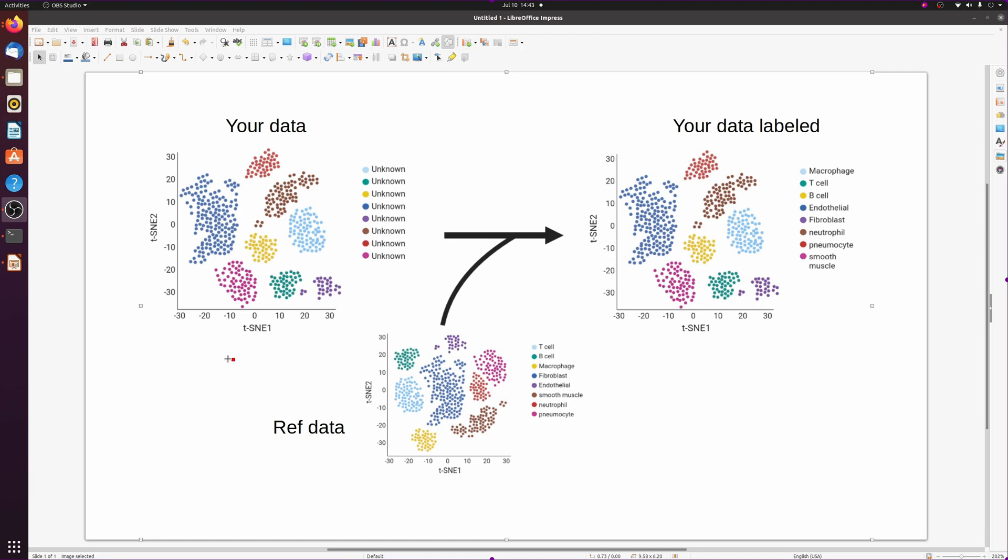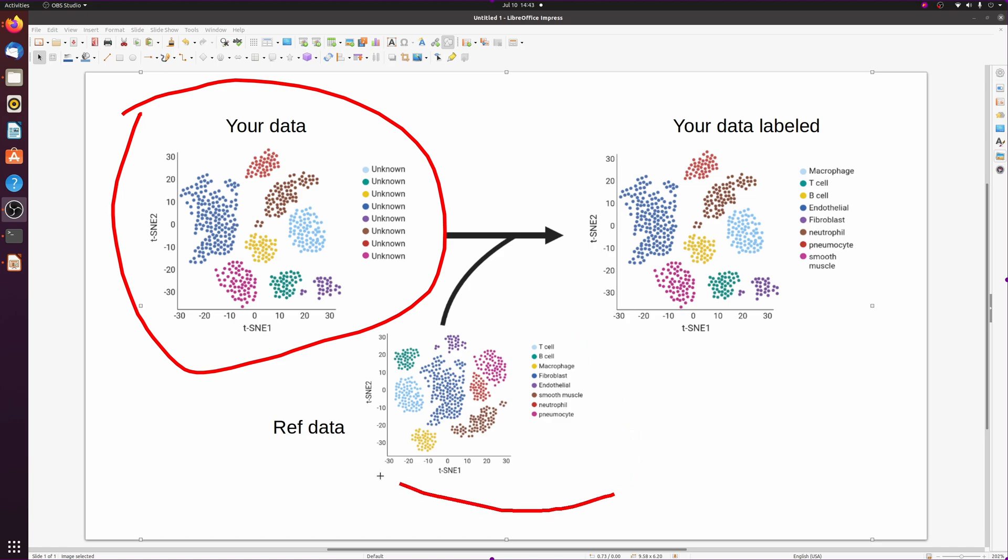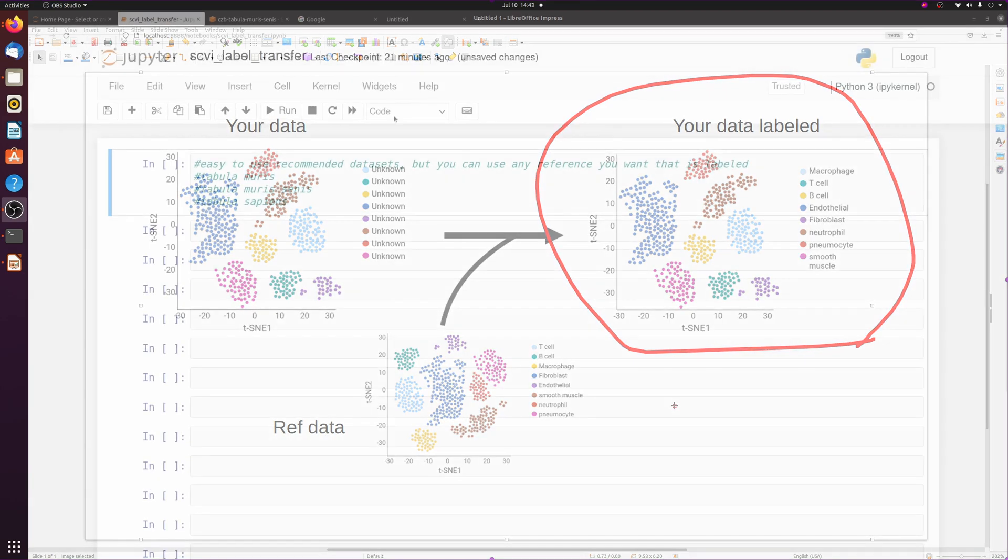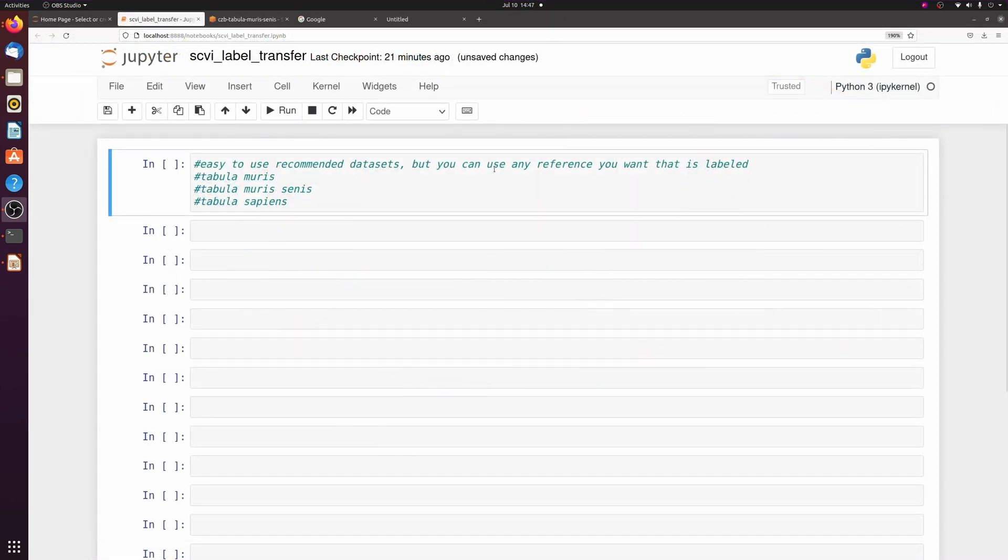Alright, so what we're going to be doing is pretty straightforward. We're going to take your dataset, which is unlabeled, and we're going to transfer the labels from a publicly available dataset to label your data. This is an easy automated way to label the cell types of your single cell data.